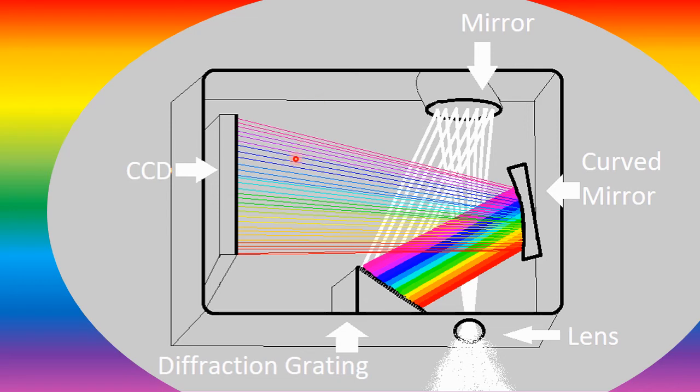But with the nature of this setup, as the light is split up once it reaches the detector, different parts of the detector will correspond to different wavelengths, meaning that we can collect data in the form of intensity as a function of wavelength. So basically, we automatically have a reflectance spectra.